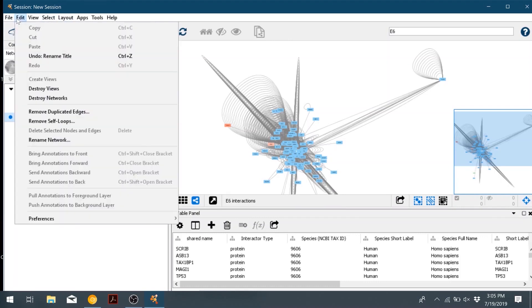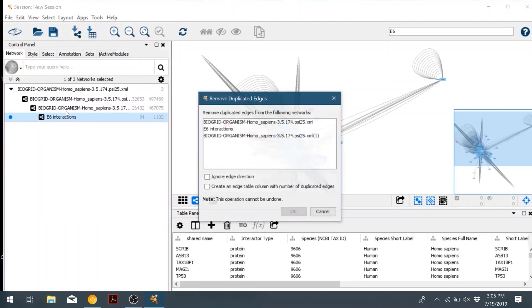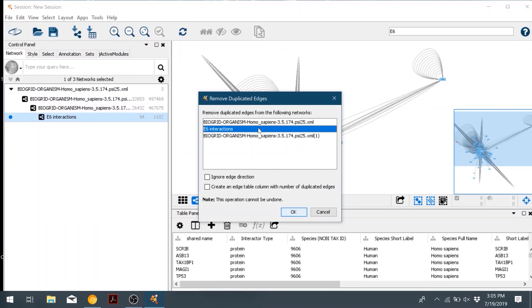So we're going to go ahead and go edit and then remove duplicated edges. A window will pop up and ask us which network we'd like to do this. We'll go ahead and do it on our E6 one.